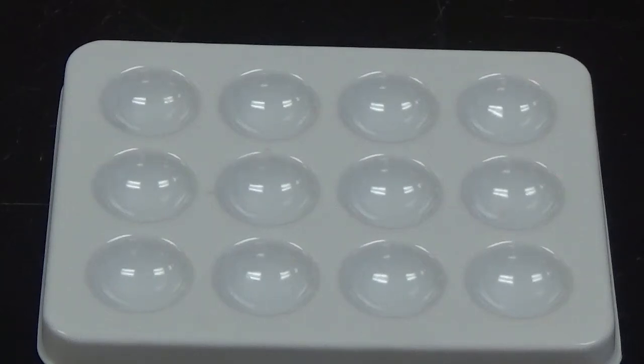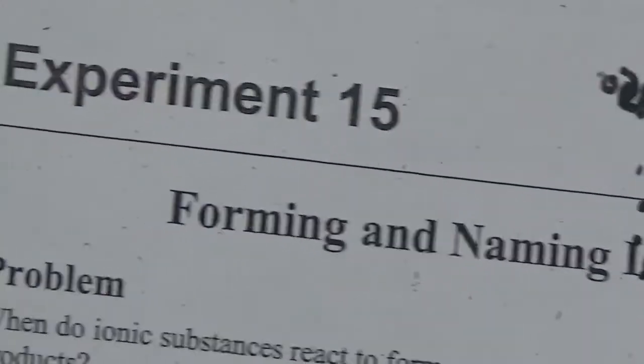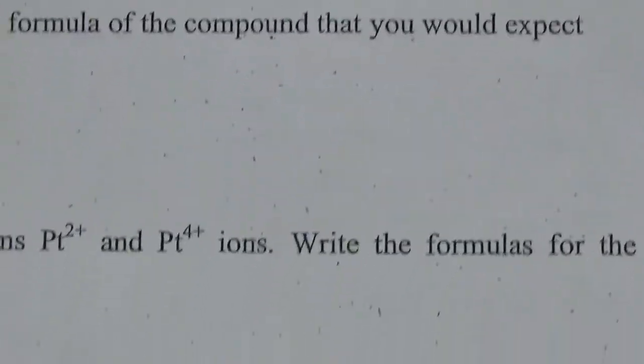Alright guys, we are going to do the procedure for the forming and naming ionic compounds lab. It looks like that. Please excuse all of my writing all over the paper that I have there.